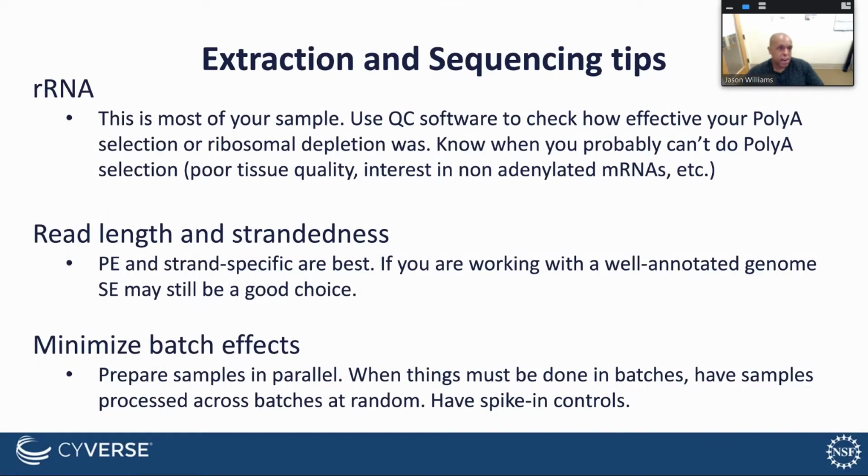So I just mentioned that in most cases for this type of procedure, getting rid of ribosomal RNAs or things that you don't care about is really important. Read length and strandedness. A lot of times being strand specific, we're caring, if you think about, not necessarily microbiological systems, but sometimes people think about things like phasing and where you're actually dealing with animals or plants.